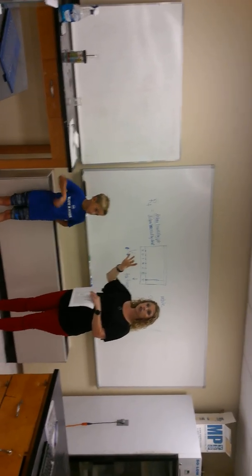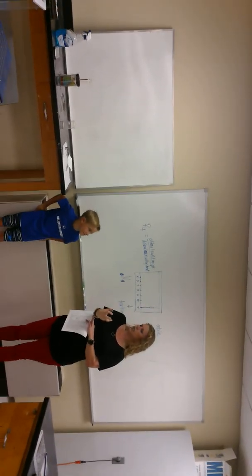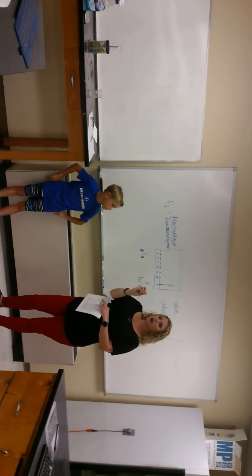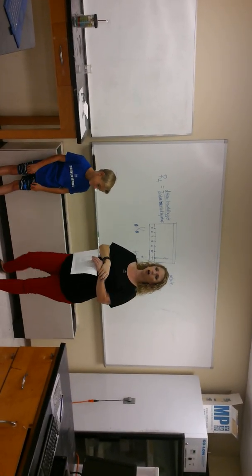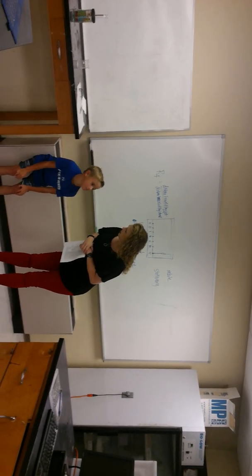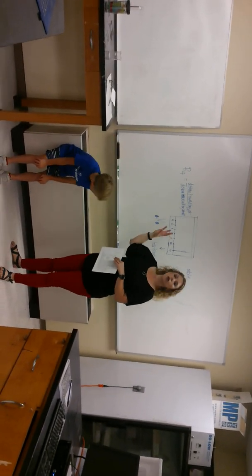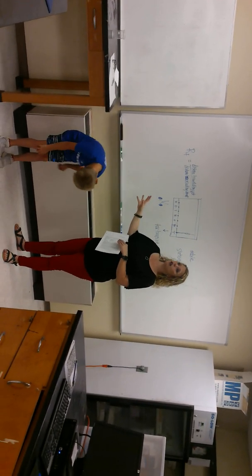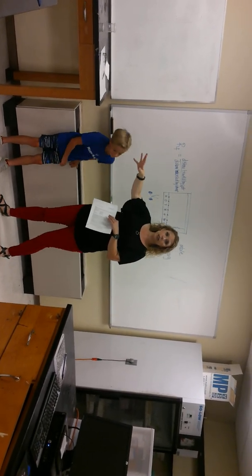You need to really watch and pay attention because we want as little chocolate and that kind of stuff in it as possible. So once the candy coating comes off, the only one that's hard to tell is the brown one. That's right, the brown one's kind of hard because it's why? Why is it hard? It's brown. And it's the same color as what? Chocolate. The chocolate, so it's kind of hard to tell. The rest of them, it's pretty simple. So as soon as the candy coating comes off, pull it off, and then again, get your waste beaker.